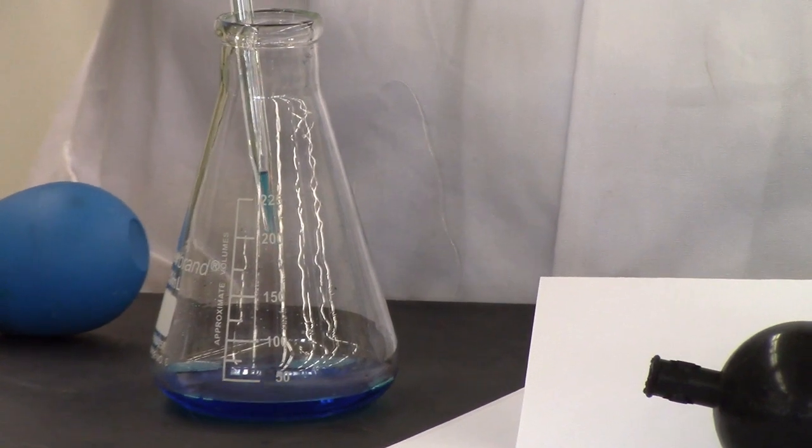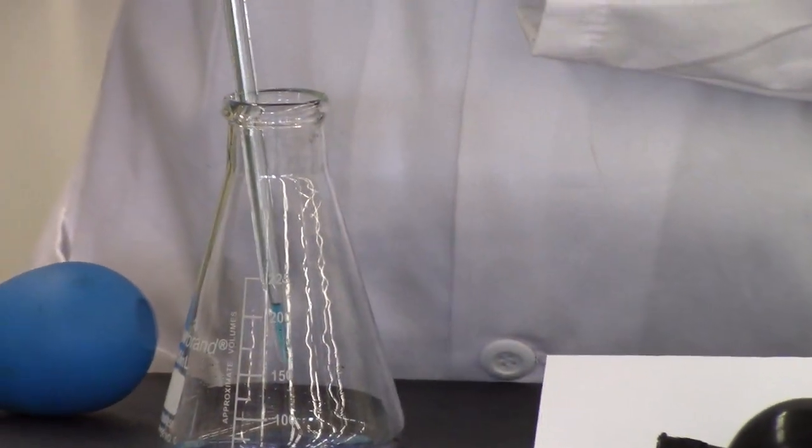Leave it there. The glassware is calibrated to contain, well, this is to contain exactly 250.00 milliliters if you fill it to the line. This is TD, to deliver.